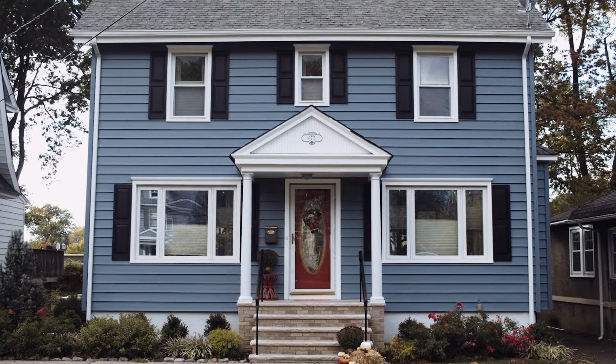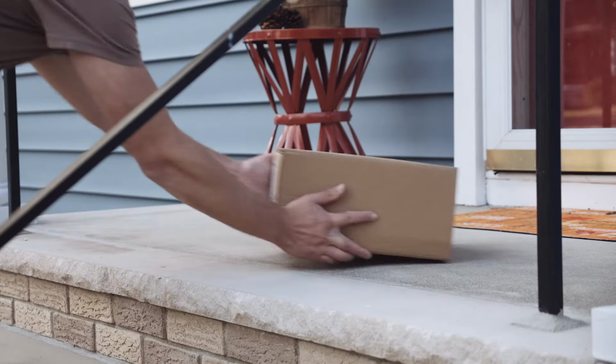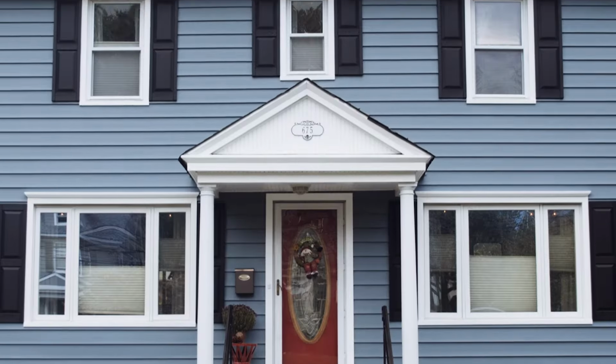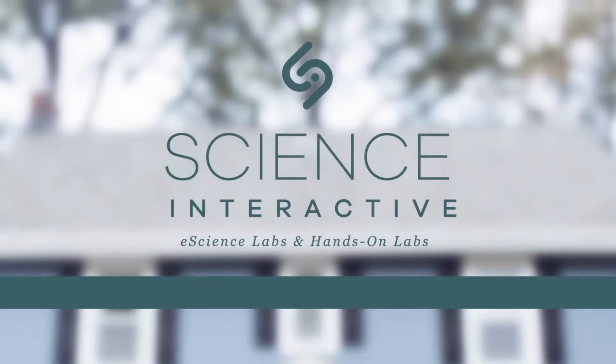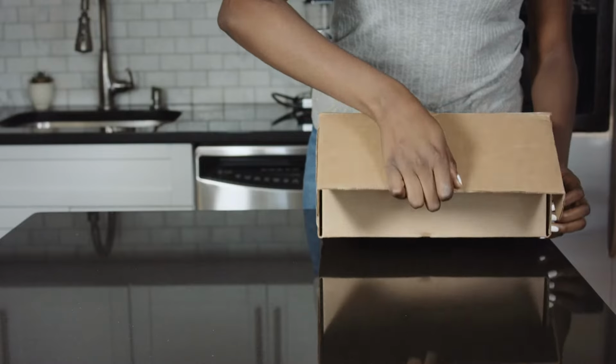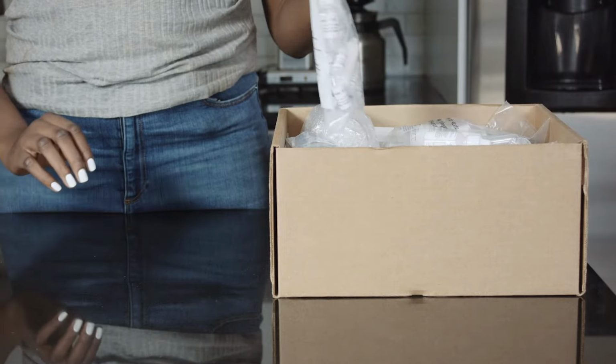Science Interactive's award-winning lab kits enable you to take your science lab online easily and effectively. Shipped right to your student's doorstep, our kits combine physical materials with rigorous curriculum. Each kit is customized to align with the lessons you have selected.